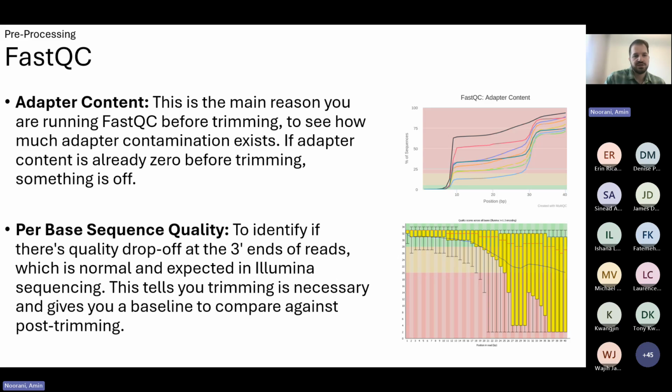Today we're not going to go through every single metric available, because this is not a bioinformatics course in general. We want to talk about, as someone who worked with this type of data, what metrics were the most important ones that you should pay attention to in the beginning. And if they fail, you should go back and think about all the factors that could involve you getting some low quality in those metrics.